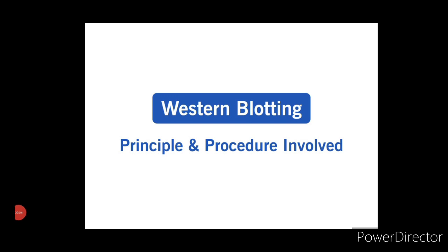The topic that I am going to discuss today is Western blotting technique, which is one of the most popular and widely used immunoblotting techniques for detection of proteins. In this video, I am going to discuss two things about Western blotting technique, namely first, principle of Western blotting technique, and second, procedure involved in Western blotting technique.